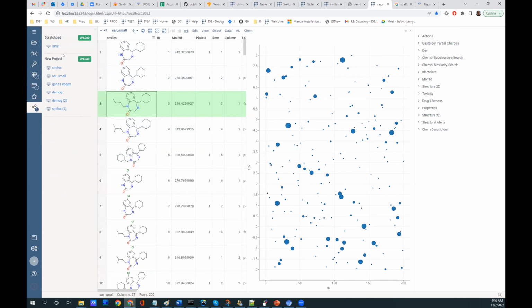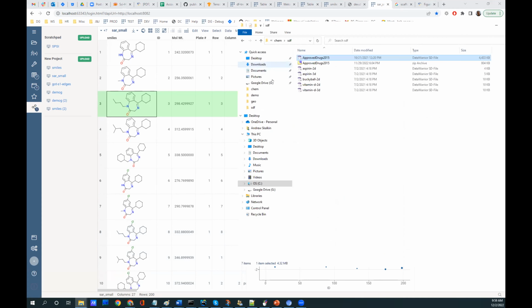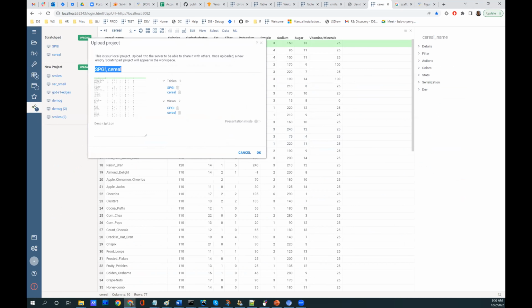Also, I've opened some local file, which now resides in what we call a scratchpad. So this is your local files not connected to anything. So if I were to just go and open some more data, see, it will appear in the scratchpad. Now, if I go ahead and let's give it a meaningful AAA name.